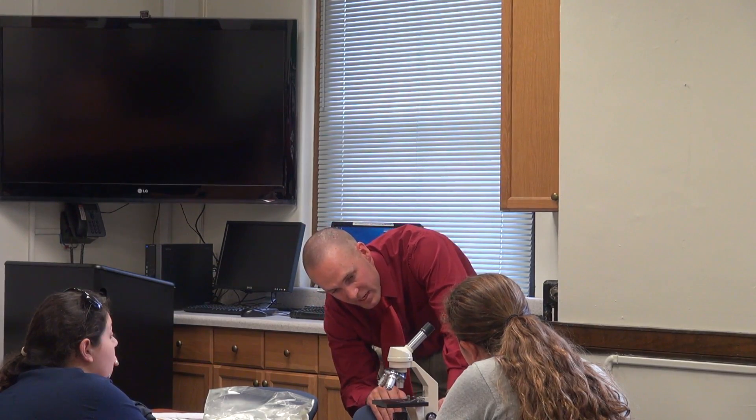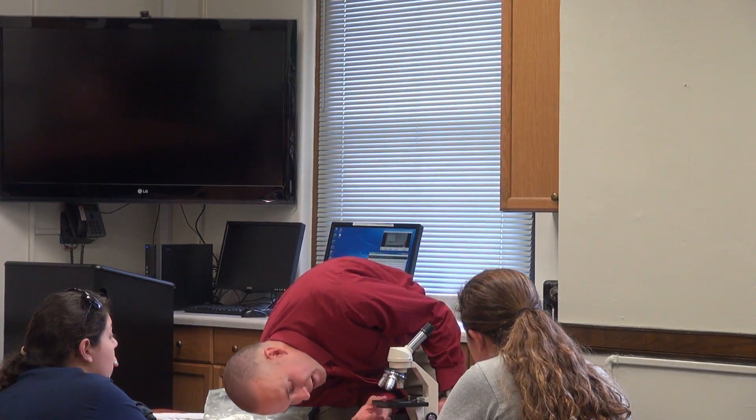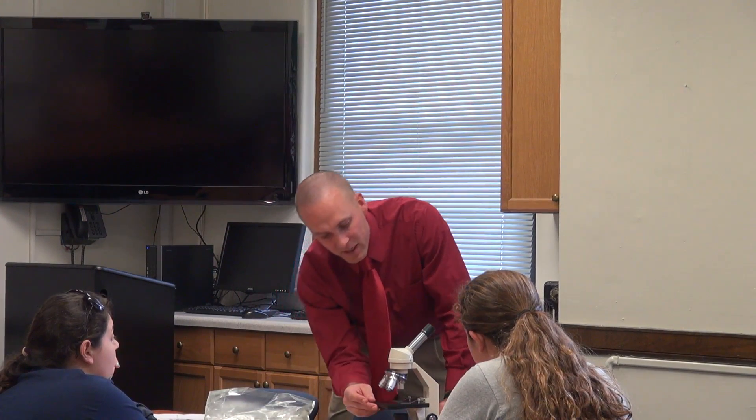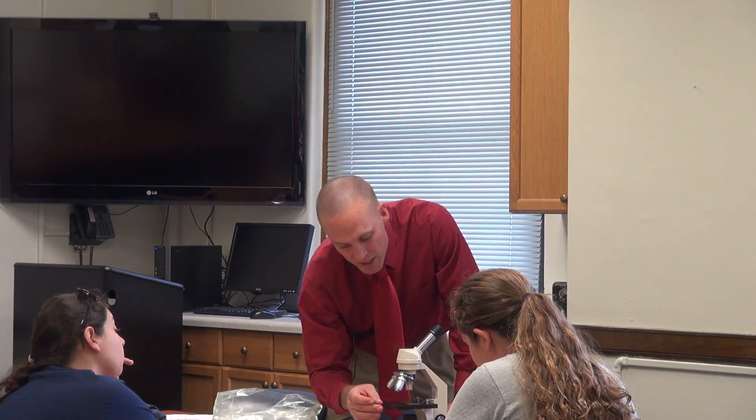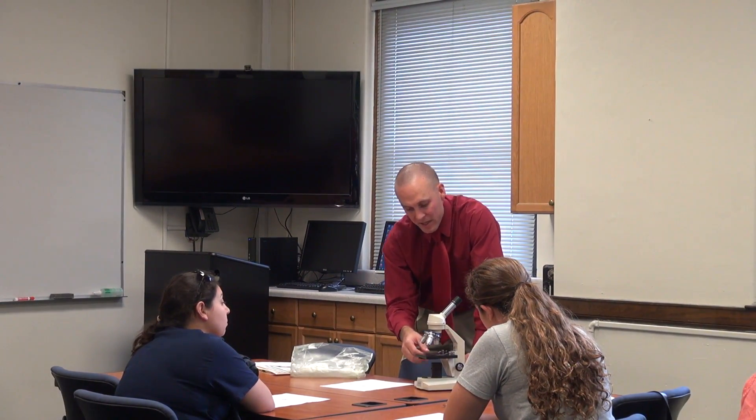Again, looking at it from the side, I want to adjust my light source to allow the most light coming through. On our specific microscopes the setting is a 5. If there isn't a corresponding number on yours, you can just look underneath and the largest hole is going to allow the most light to come through. So I have that on the starting setting.